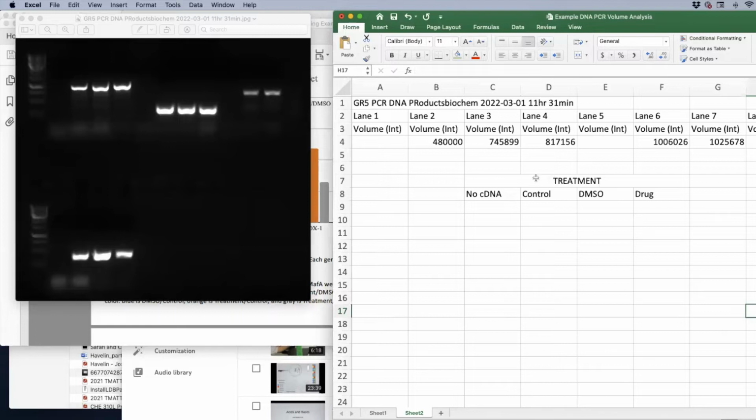Okay, so we know there's 4 treatments, right? And then genes generically, and this is going to depend on how many genes you guys all had, but this group has 4. So we're going to do 4 genes, right? And I'm just going to write gene 1, gene 2. If you guys didn't notice about Excel, Excel tries to be very helpful.